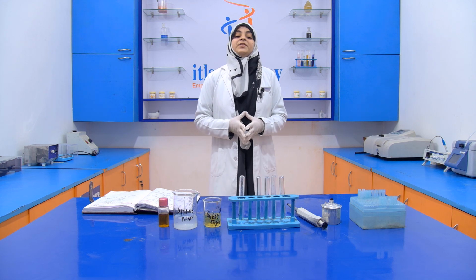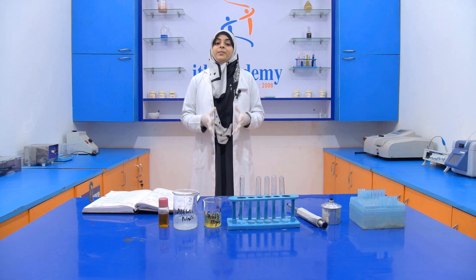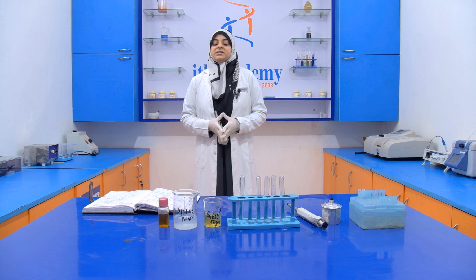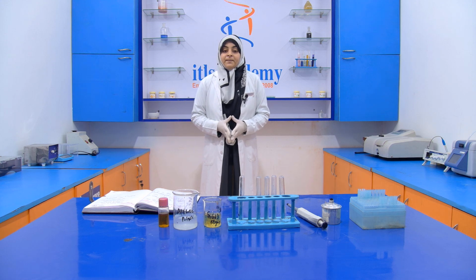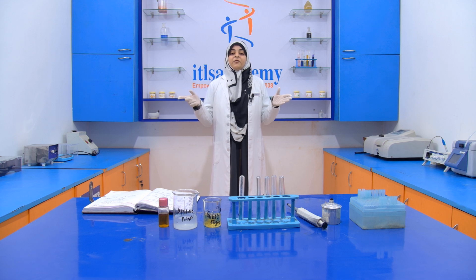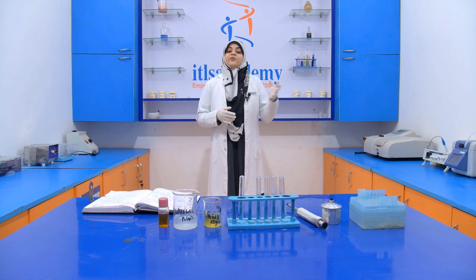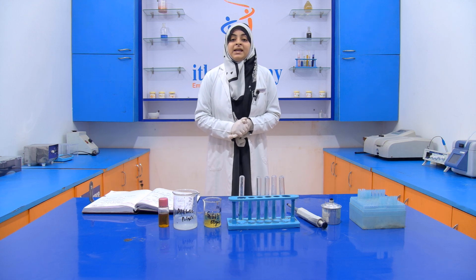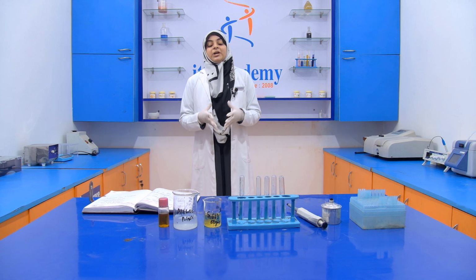For this we take 70 gram of potassium hydroxide and it is dissolved in 70 ml of distilled water. See, the amount of potassium hydroxide and the amount of distilled water is always the same. If you take 2 gram, then you have to take 2 ml of distilled water. And here we have taken pellets of potassium hydroxide.